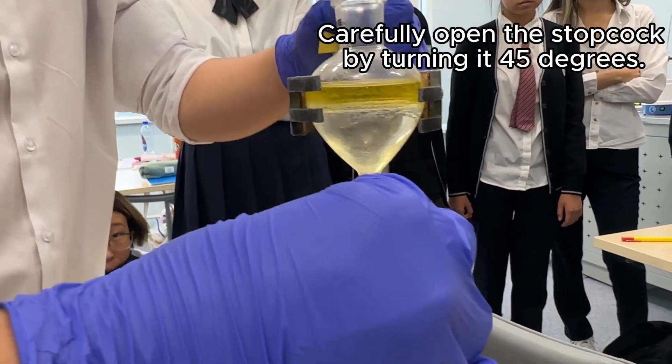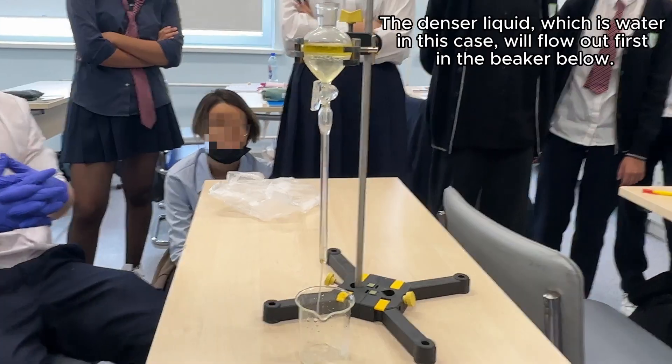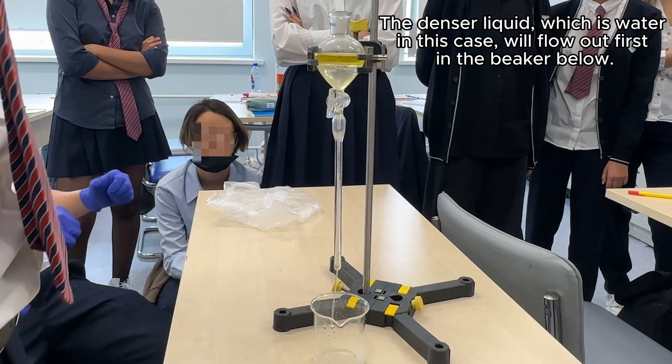Carefully open the stopcock by turning it 45 degrees. The denser liquid, which is water in this case, will flow out first into the beaker below.